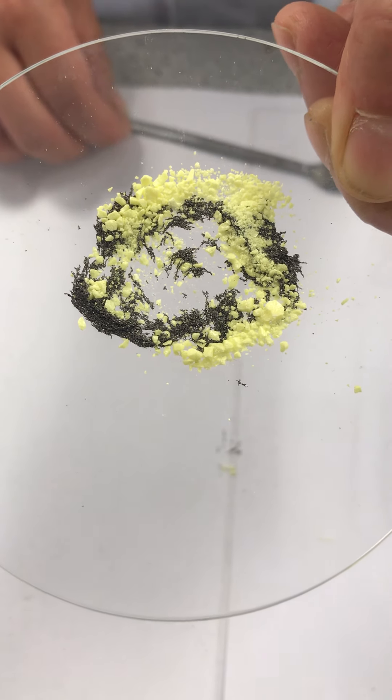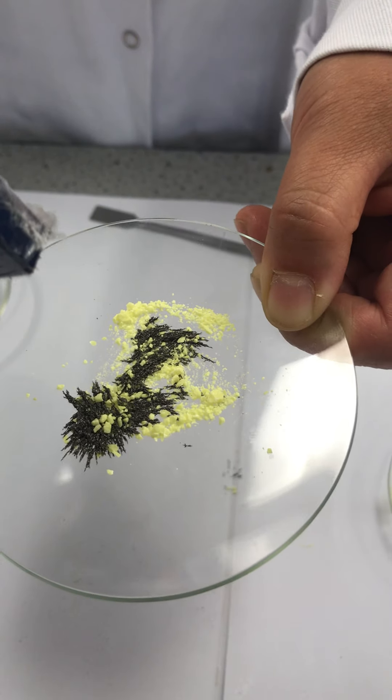Now we use a magnet and try to separate the iron from this iron-sulfur mixture. As the magnet is moved underneath the watch glass, you will see iron is attracted and sulfur isn't, so iron and sulfur can be separated. This means the components of a mixture can easily be separated by physical means.